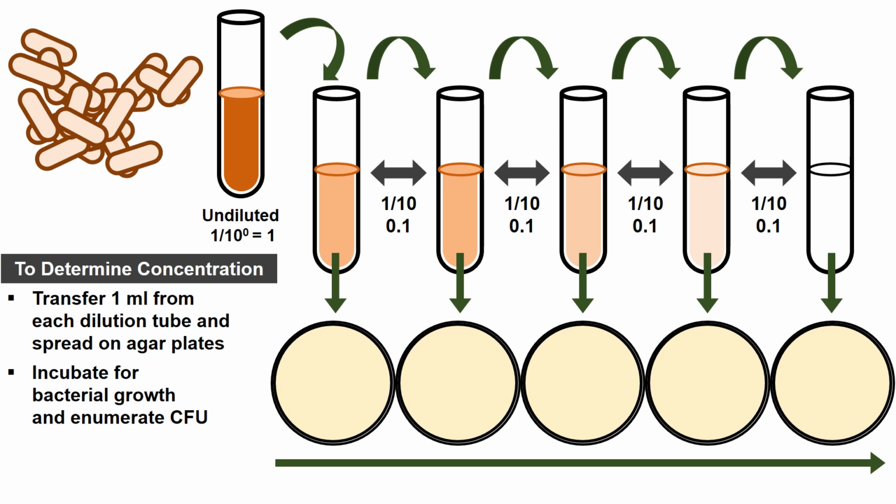So, from left to right, remember, we have 10 times less colonies in that direction, just like we had 10 times less concentration. 10 times less concentration should correlate to 10 times less colonies, aka our 10-fold concentration reductions, aka our 10-fold dilution series, from left to right.